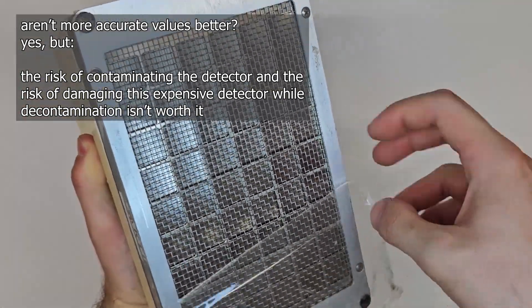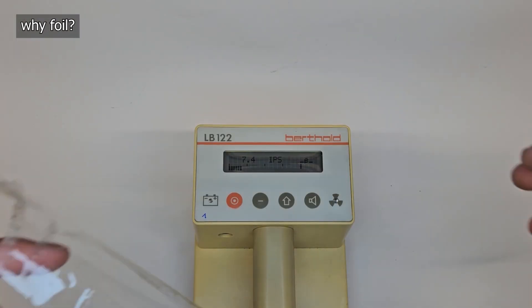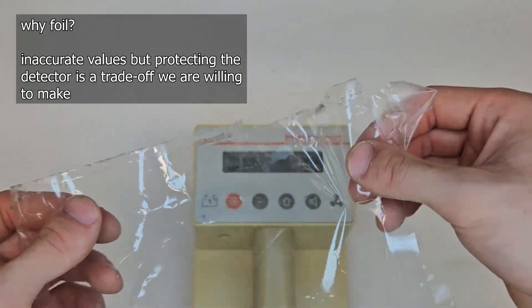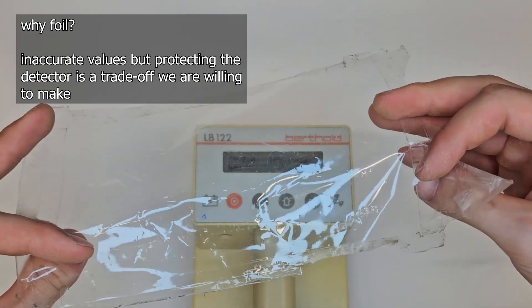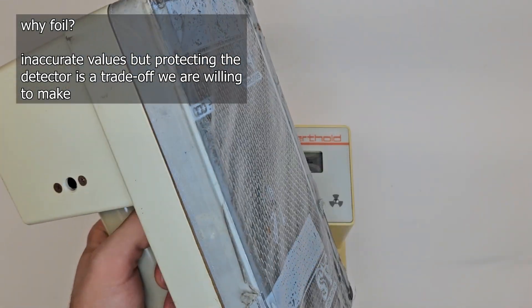Even if it means having lower or skewed readings, it's still worth it because no one wants to clean or destroy the detector. Contamination detection isn't all about exact analysis — it's about: is it contaminated or not? And if it is, does the value go down after wiping and cleaning? That's it.